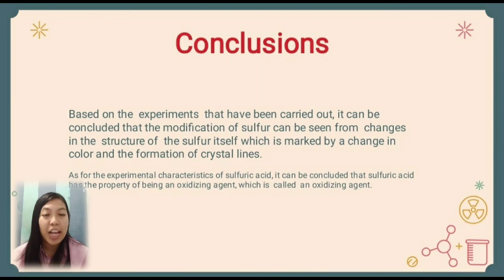As for the experiment on the characteristics of sulfuric acid, it can be concluded that sulfuric acid has the property of being an oxidizing agent.